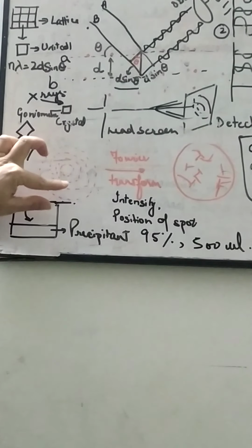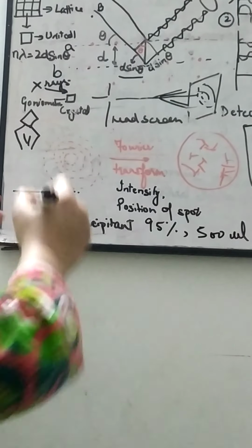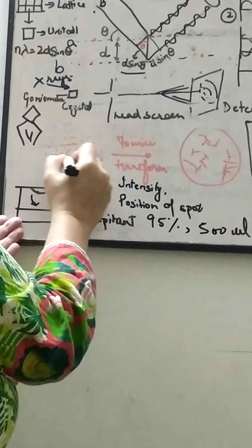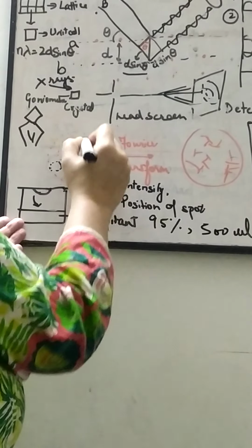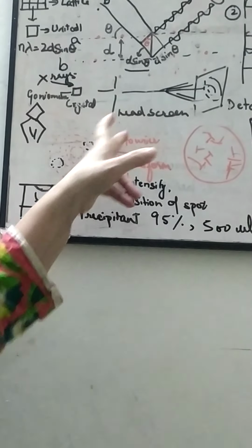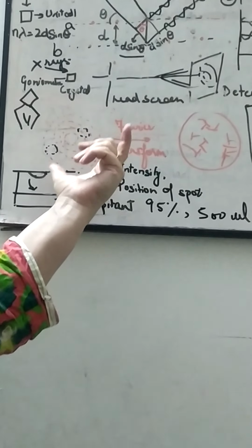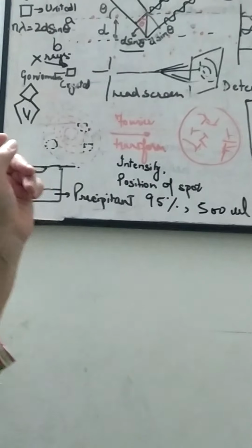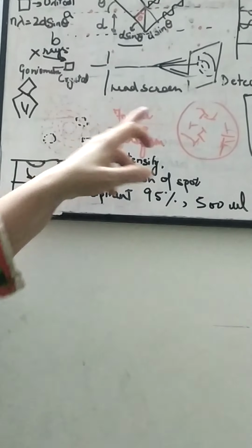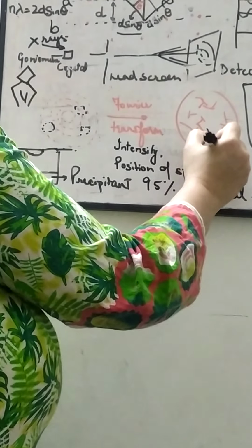We will be getting a pattern of repetitive spots. Here I have not shown it, but there can be certain specific patterns which are repetitive. Then with the help of a technique of Fourier transform, which is a mathematical algorithmic technique, it is transformed into a map which is known as an electron density map. Where the electrons are more, it will form a kind of map.